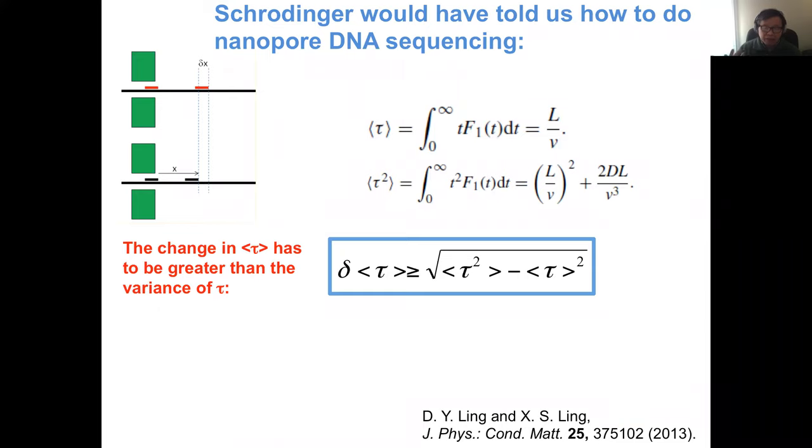Now, having this function, why is it so important? Because it allows us, for example, if we have a situation where we have two markers on, let's say, either single-stranded or double-stranded DNA, that differ by an amount delta X, with a spacing of X. The question is, can you actually discriminate between these two? Okay. The answer is yes. And then the question is how?